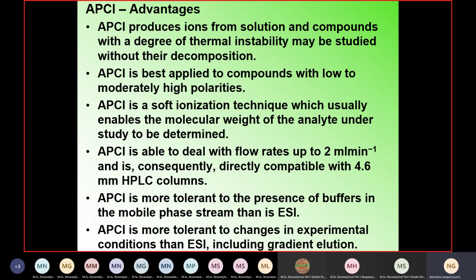Here the solvent has a big role because the solvent itself is first going to get charged, form positive ions, and subsequently interact with my compound of interest and form the ions of my compound of interest. So as much solvent as there is, it will help my ionization.